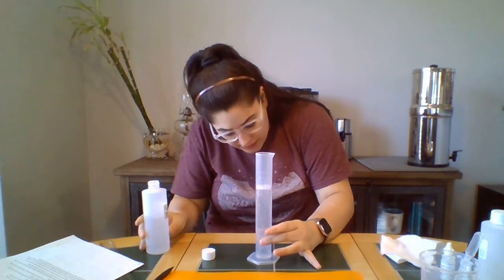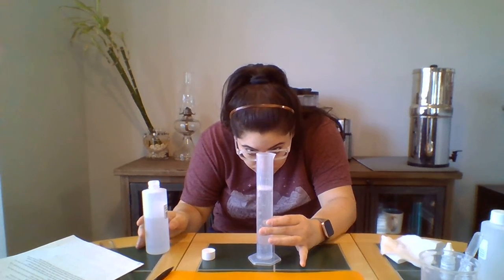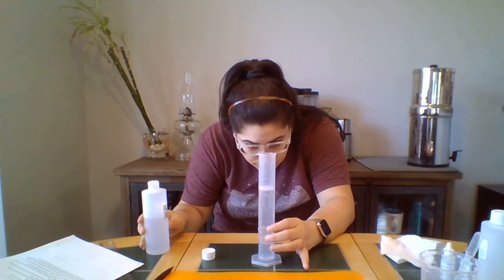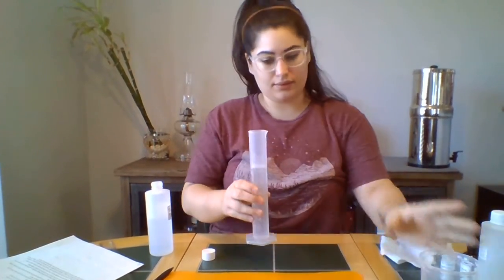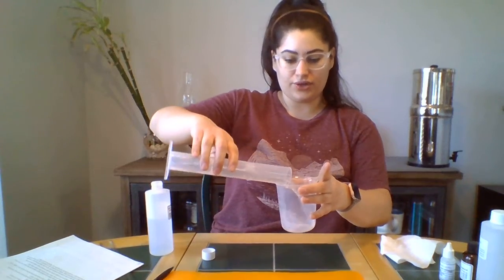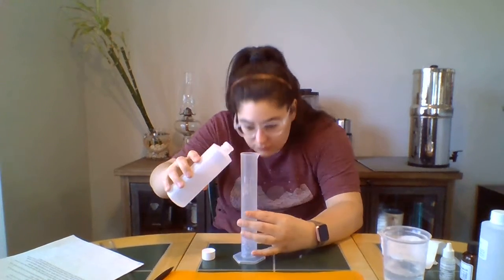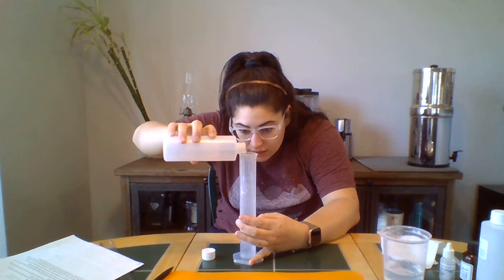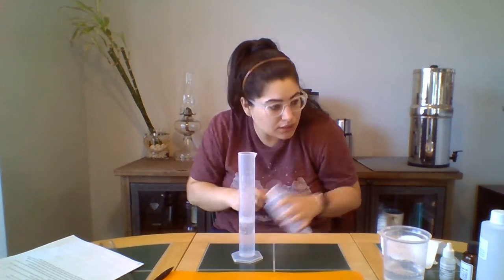I'll let the bubbles go down. Oh wow, right on the money. Okay. All right. So we'll pour that 100 in first. And then we need 50 more. And that's right there. I think that should be good.